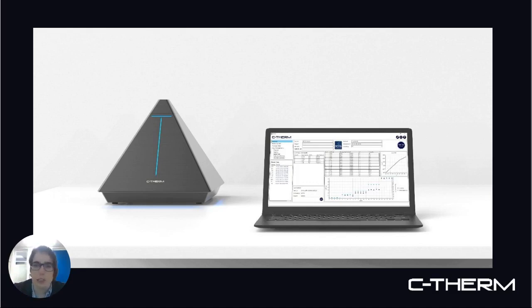They just get the test results in a table like you see here. In the case of the transient line source and transient plane source, some user input is required to analyze the data, but it's highly automated and intuitive in terms of how to use the software to get good quality data.